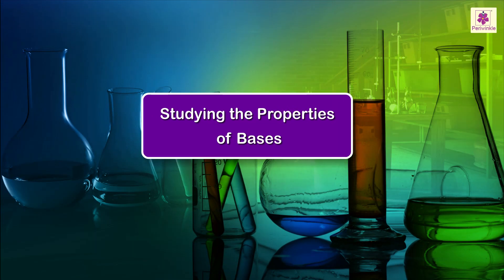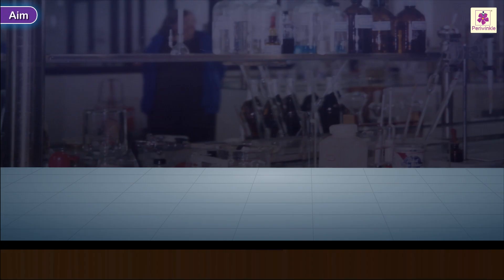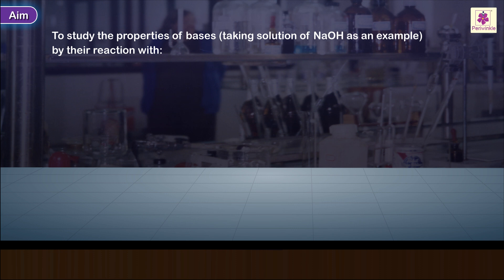Studying the properties of bases. Aim: to study the properties of bases taking a solution of sodium hydroxide as an example.